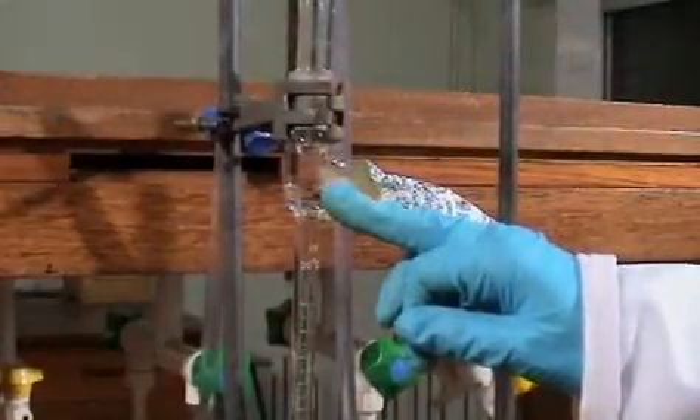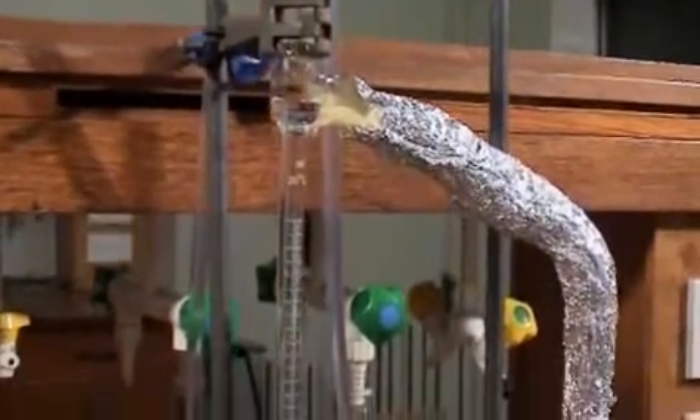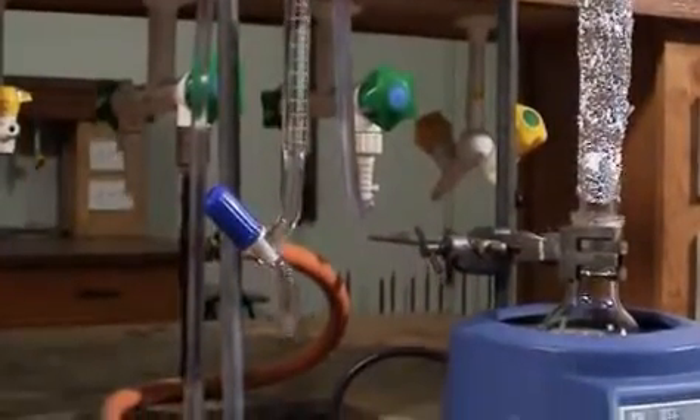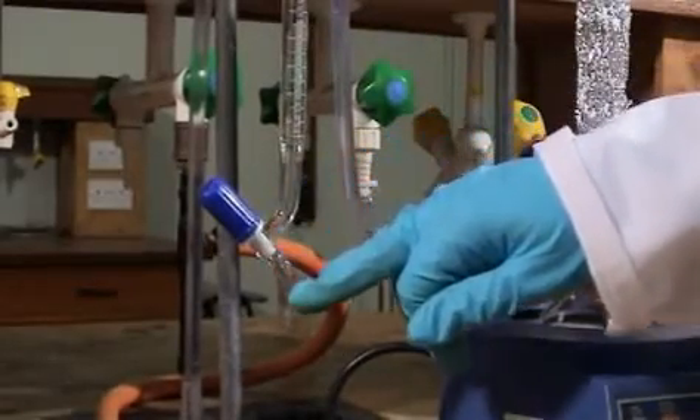Once the sidearm is full, the solvent will overflow back into the reaction flask. If you're producing quite a lot of water, you might want to drain some of it off to the bottom.